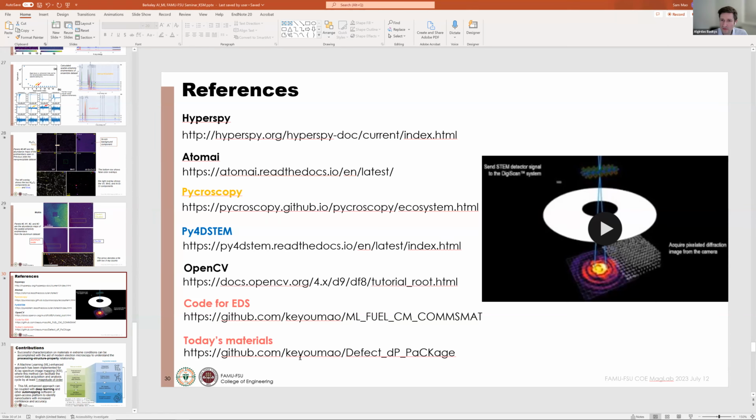Also, if I understand the general workflow, taking the Repco example that you mentioned, you use the imaging detector, either secondary electron or backscattered, to take the tiles and then stitch them, using that data to actually stitch the EDS maps as well. Yes. Okay.